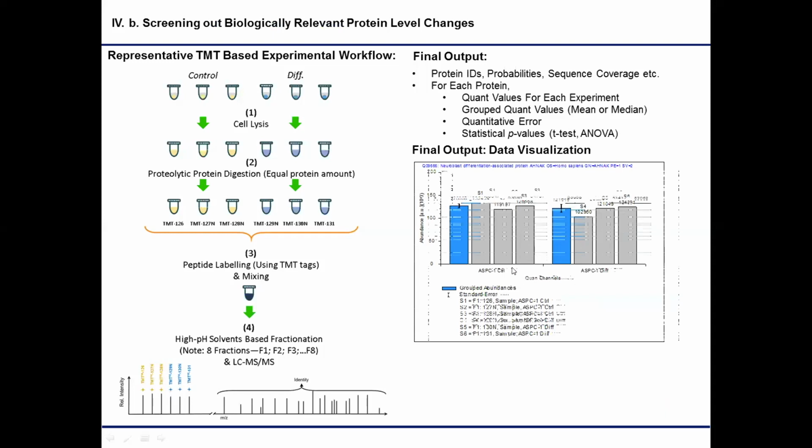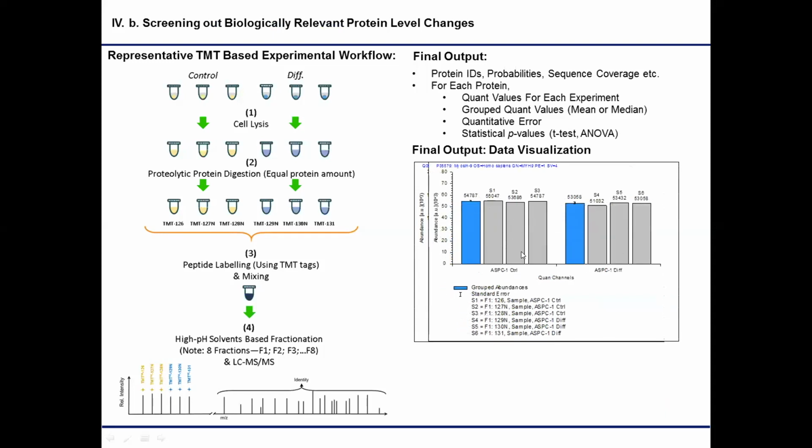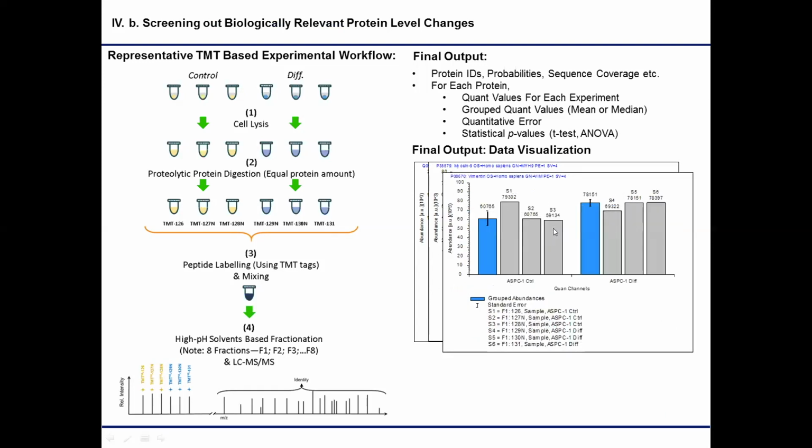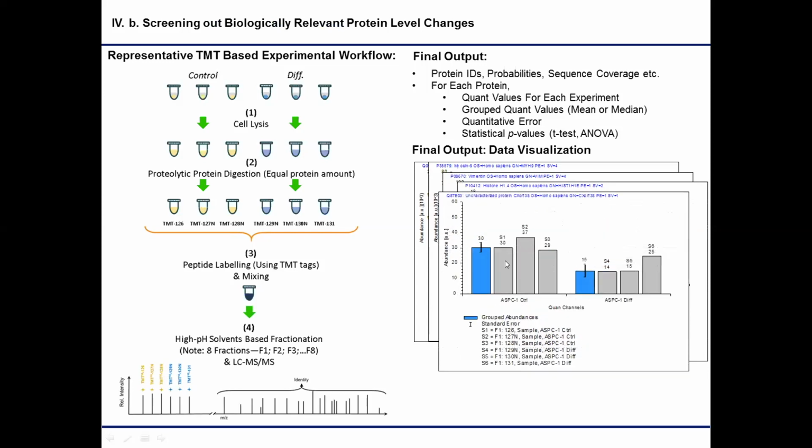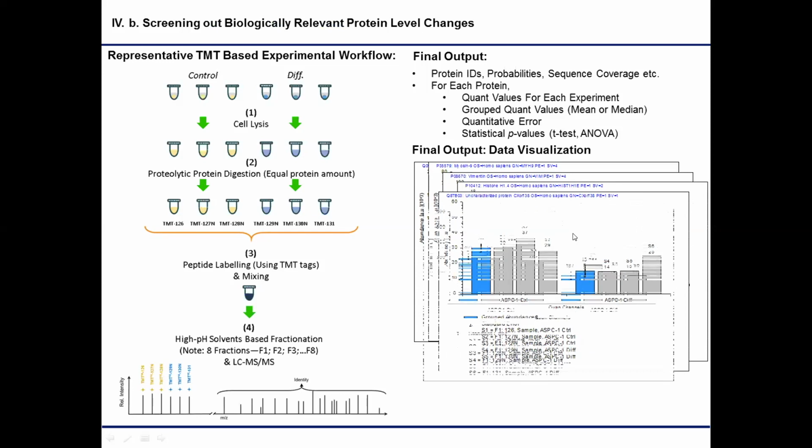So there will be many of them. Here, as you can see, there isn't that much of a difference taking place in this particular protein. And there are some subtle changes taking place. And it seems like it's statistically significant in this particular protein. And this one is going in the opposite direction.